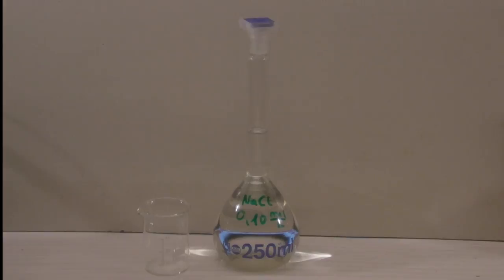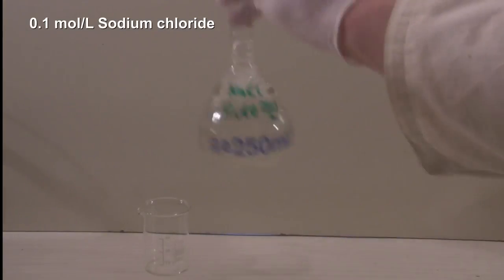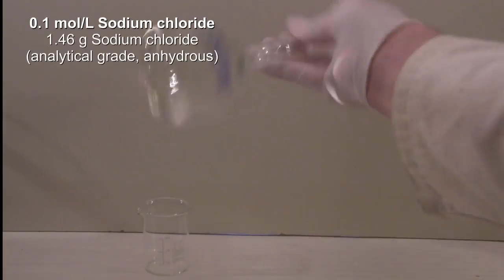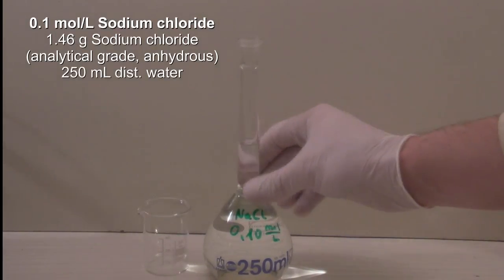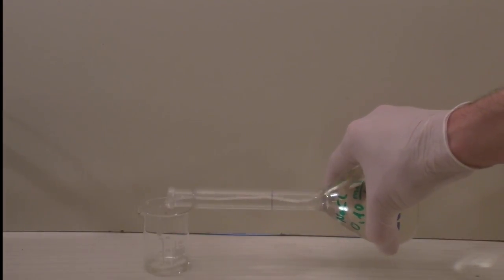For the measurement, two solutions were prepared. First, a 0.1 molar standard solution of sodium chloride. This was made by dissolving 1.46 grams of anhydrous analytical grade sodium chloride in 250 milliliters of distilled water. Before use, the solution should always be shaken.